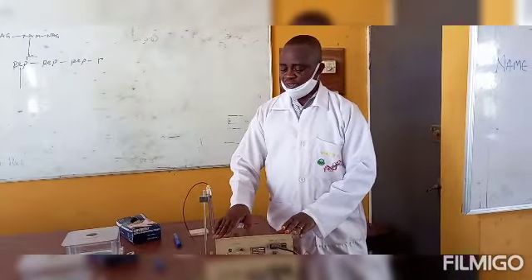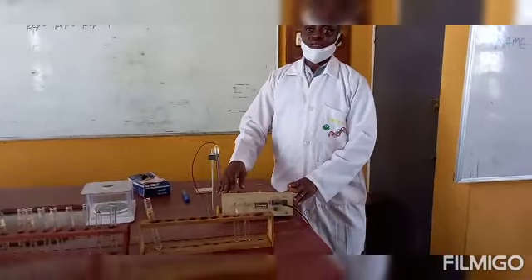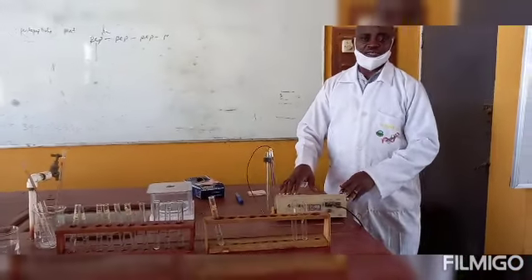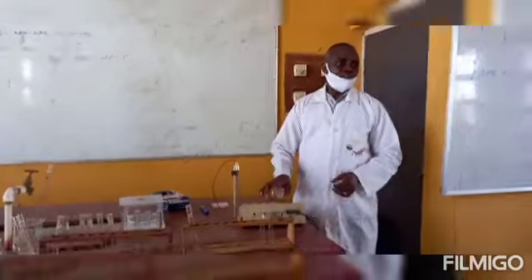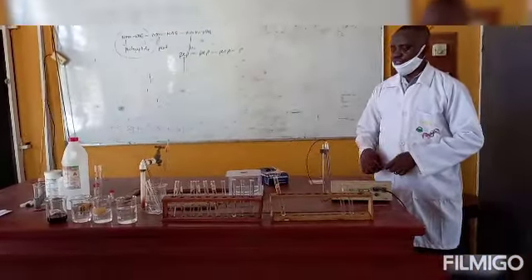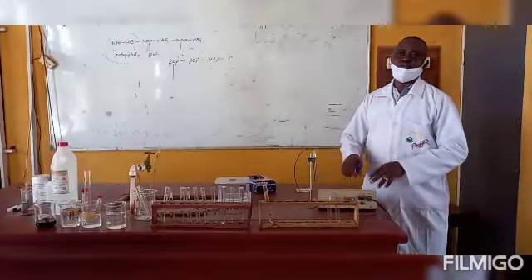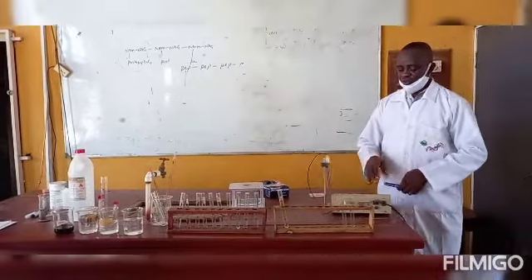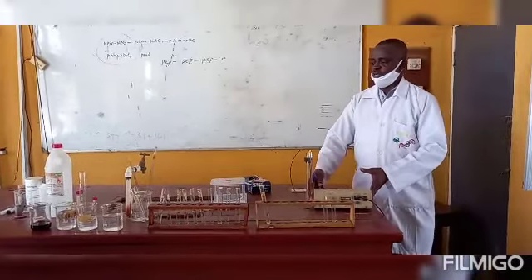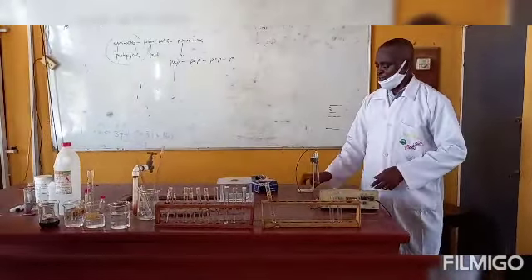We are not going to deal with that as much today. I only want to show you that you can use equipment in taking the measurement of your pH. The name of that equipment is pH meter. We have it in different sizes from different manufacturers. This is the particular one we make use of in our laboratory here.